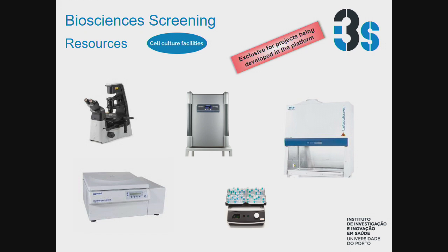We also have cell culture facilities, but these are exclusive for projects being developed within the bioscience screening platform. The i3S has another platform that can host your cell culture work.